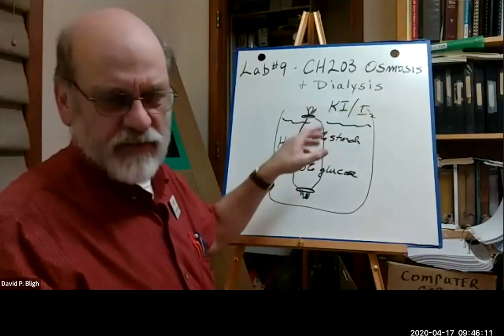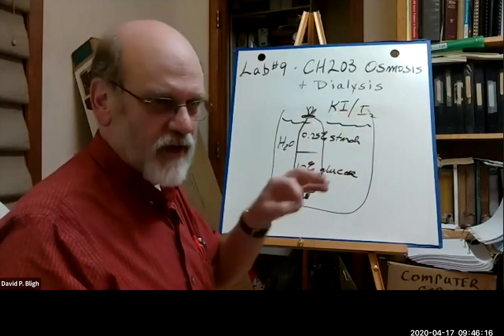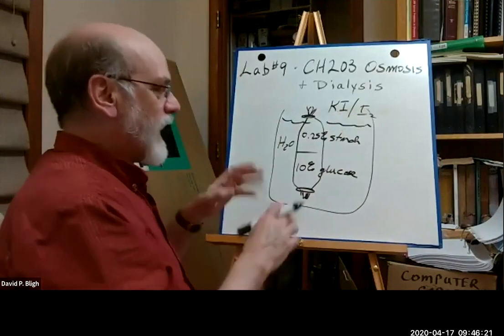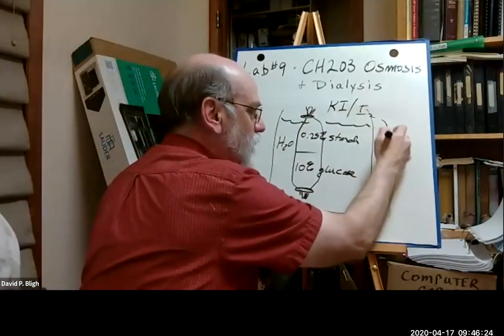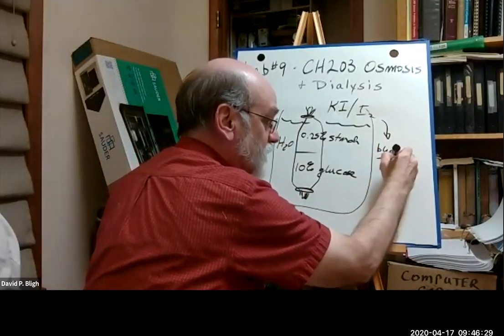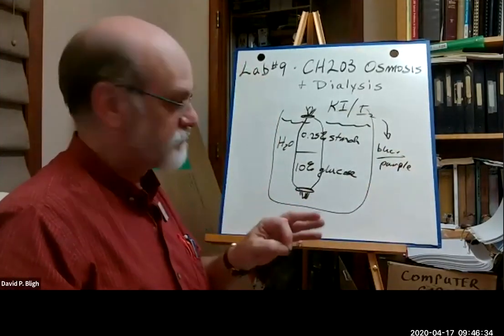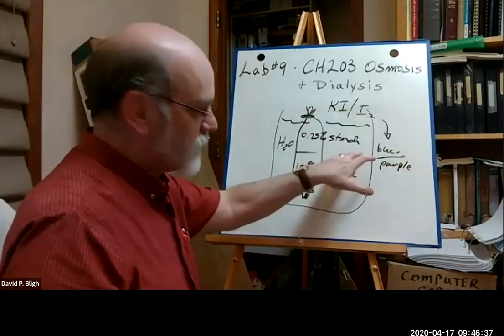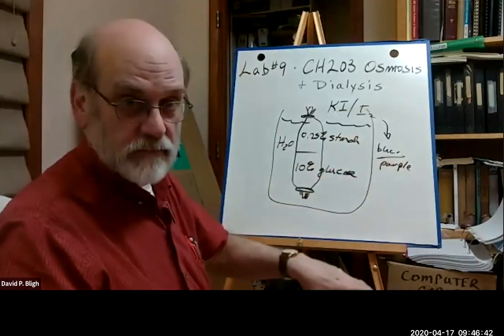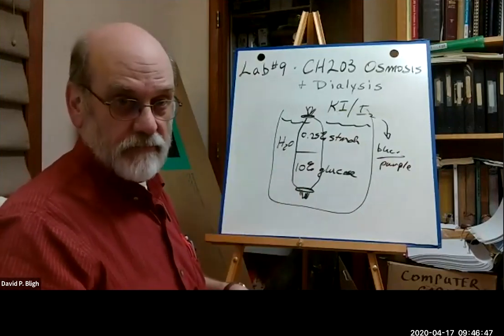I'm not going to talk about the chemistry right now, but what happens is when you add that to a solution, if there's any starch, and it's extremely sensitive, very low concentrations of starch, you develop a blue to purple, sometimes a very dark purple color. Right? So it's very specific for starch. So if you've got any starch out here in that solution, when you test it, it's going to turn blue-purple. Right? If you don't, you won't see any change in color.